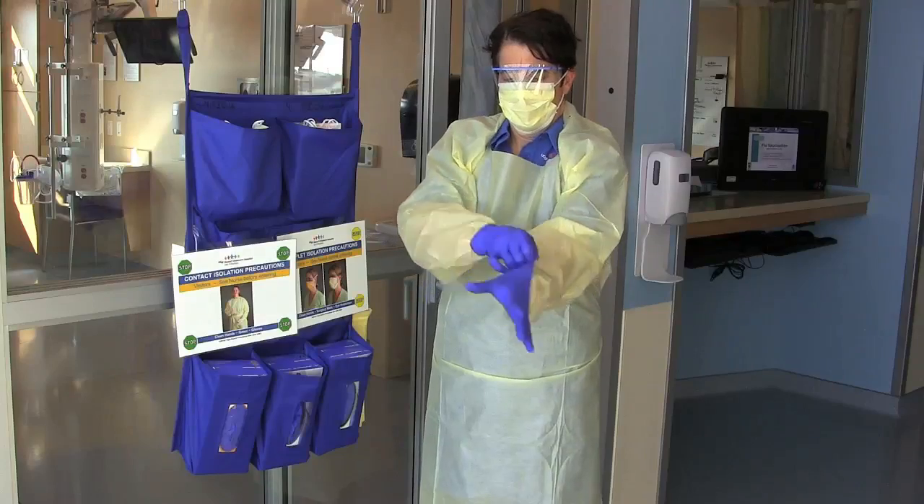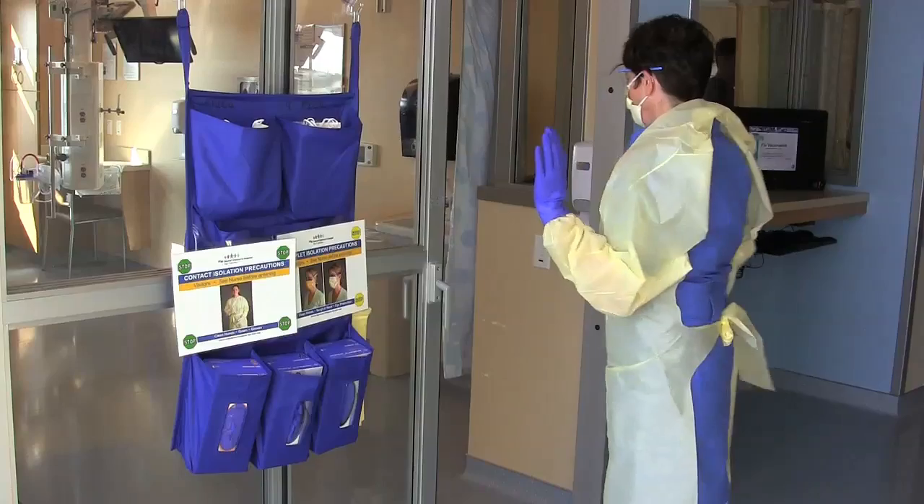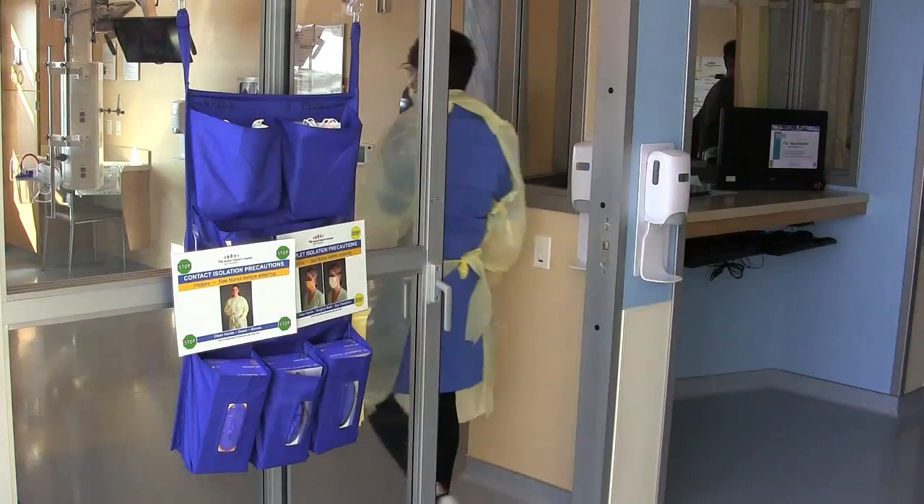Prior to entering the room, you must have all the PPE properly in place. Now you are ready to open the door and safely care for your patient.